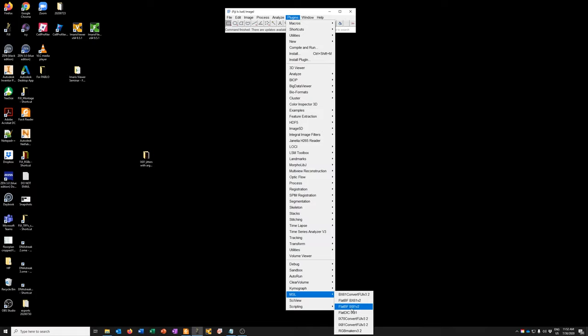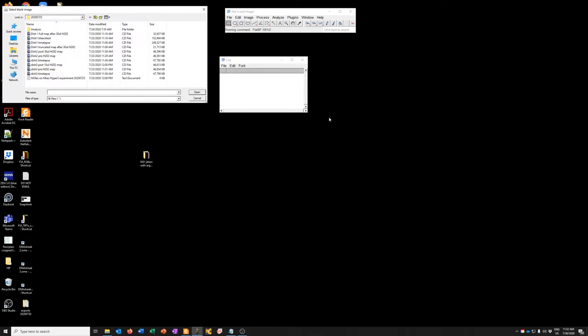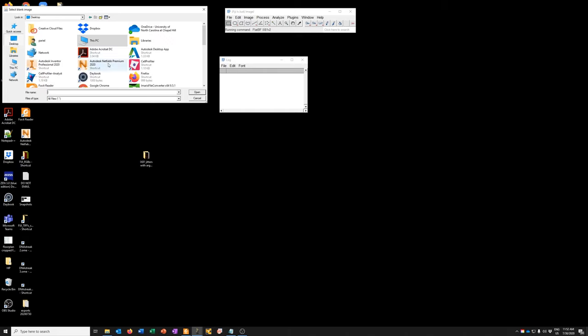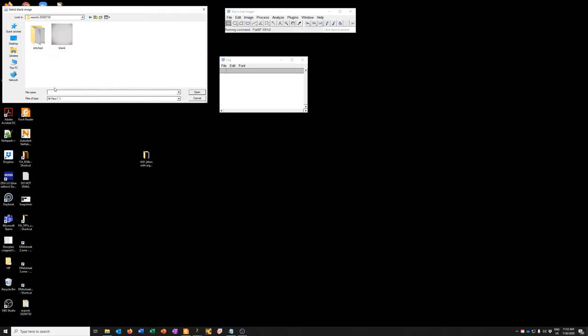Okay, so let's do the flat fielding. I'm going to select the proper macro, which is this one. It's asking me what objective I want to use. We want to use 10x because that's how we acquired the data. And I've put the data on my desktop. So here's the data folder.